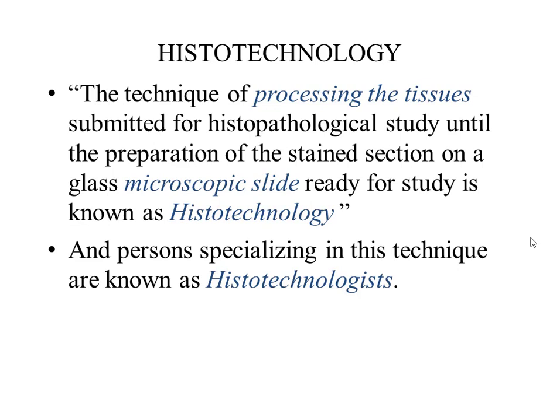Histotechnology is the technique of processing the tissue submitted for the histological study until the preparation of the stained section on a glass microscopic slide ready for study. A person specializing in these techniques is known as a histotechnologist.